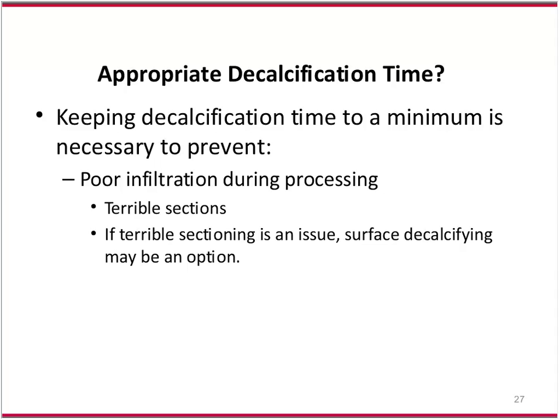Whether somebody brings samples to you and says, I'd like to submit these samples to your core to have you process and embed and cut them, and I've already done the fixing and the decalcifying, all you have to do is process. Well, we hear that quite often. As a fee-for-service, people can bring in things that they've started along the way, and it saves them money. So I understand that.